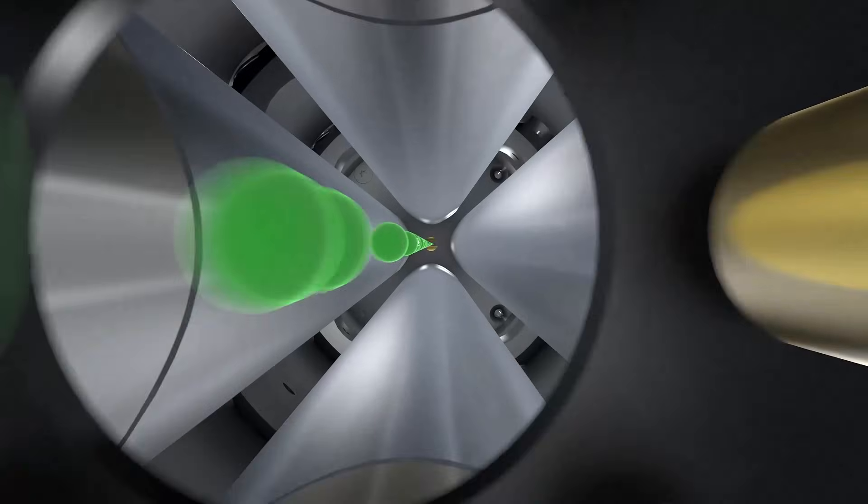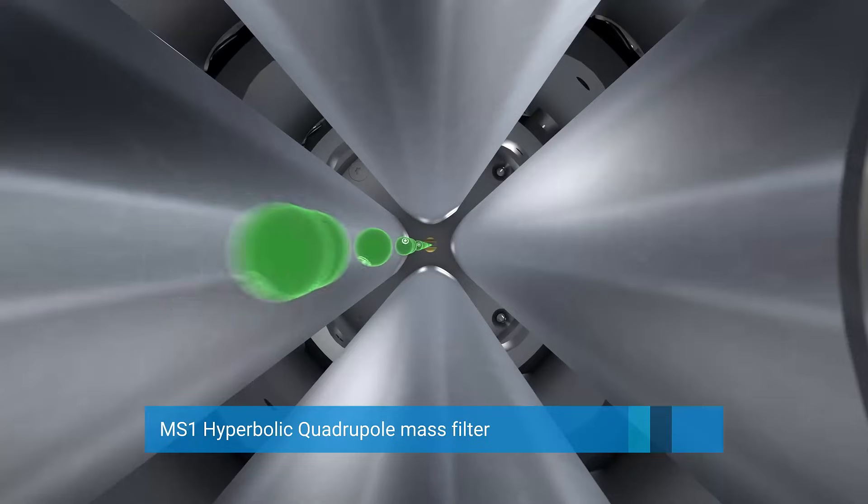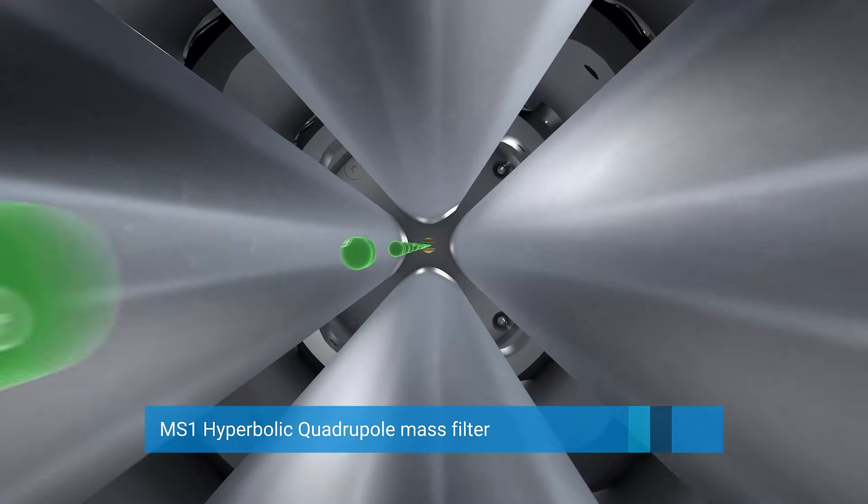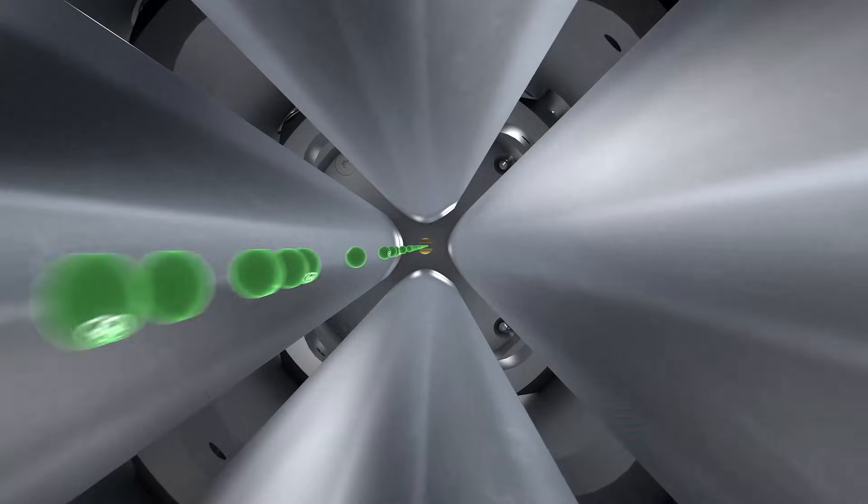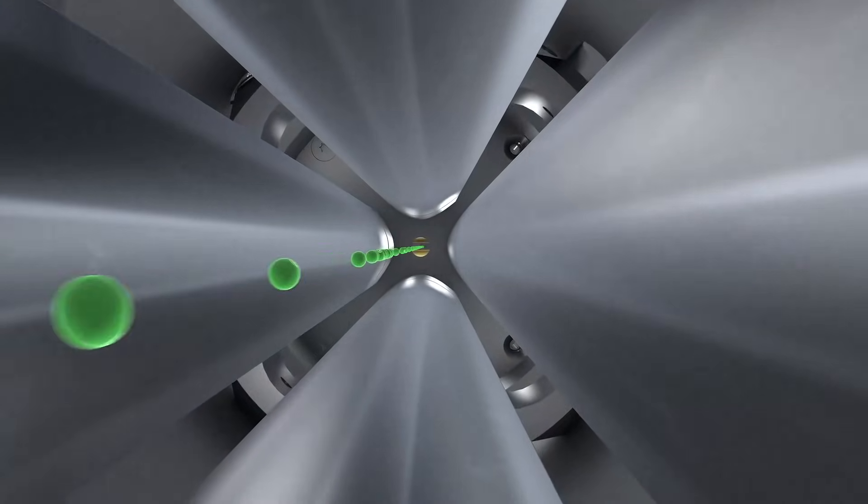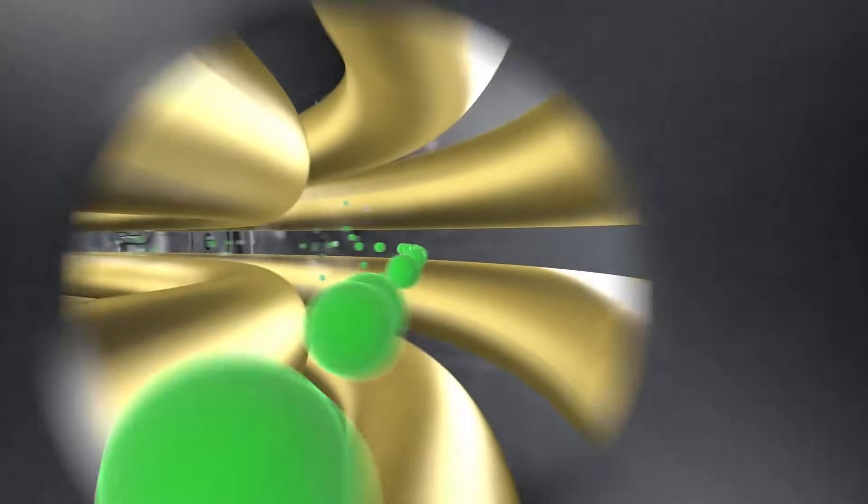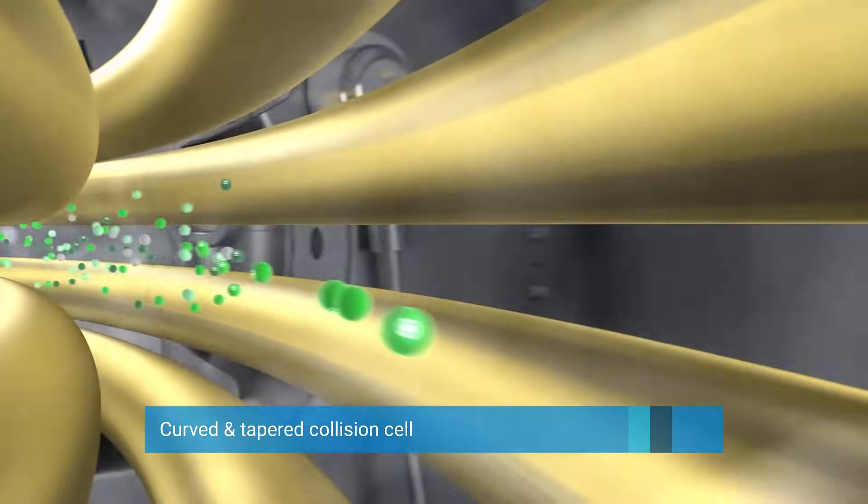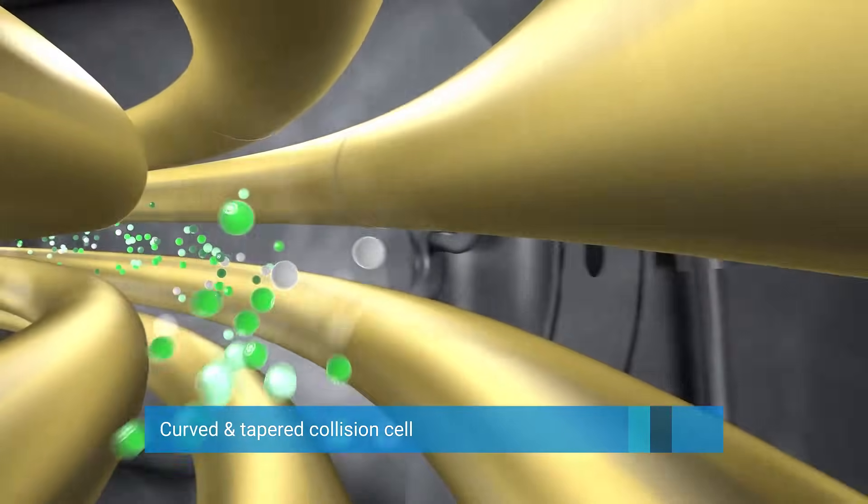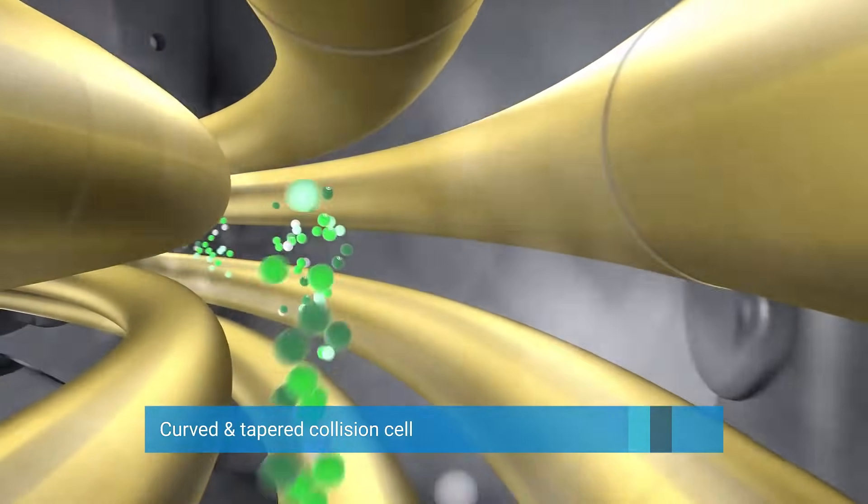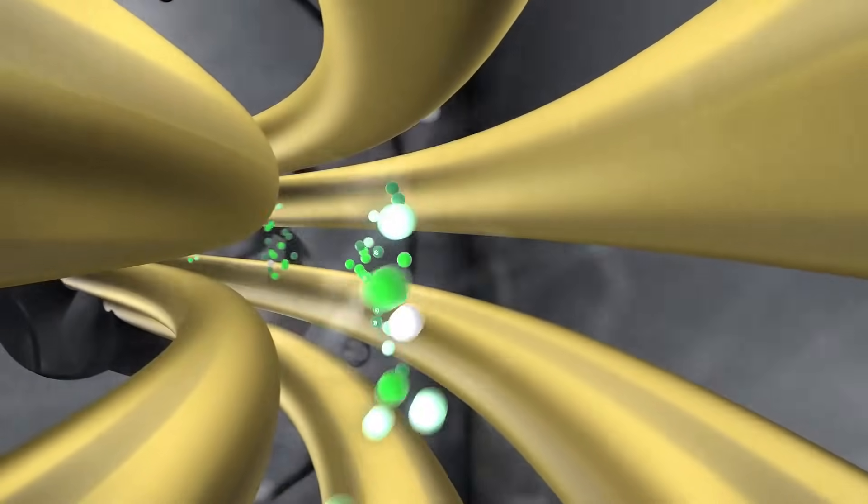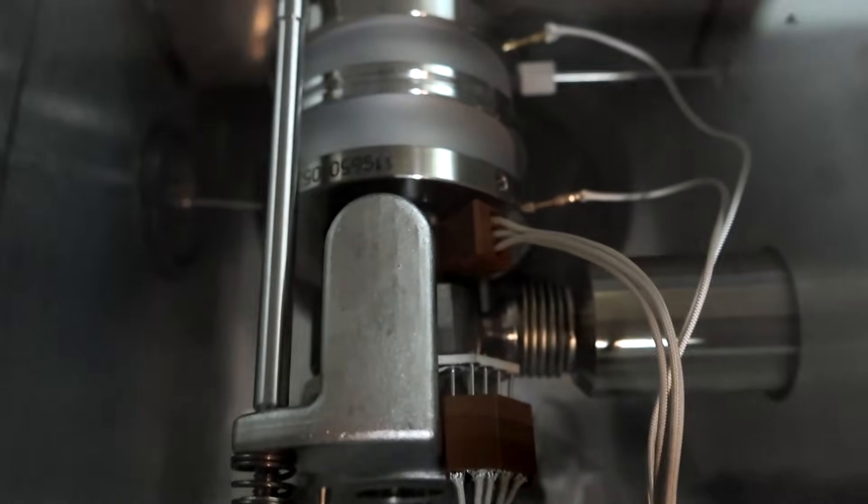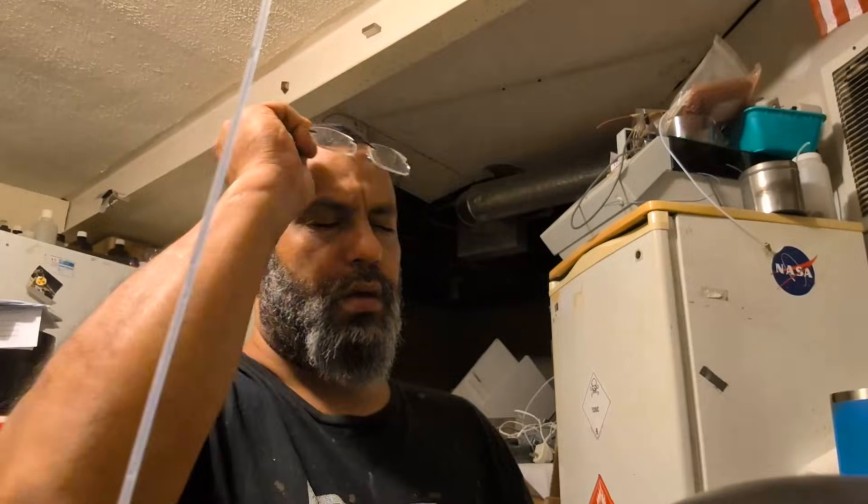The first quadrupole is a rough mass filter, but the resolution can be refined further for sharper peaks. This is a necessary step for the following fragmentation in the ion trap and collision cells. Basically, the cell breaks down the molecule further so we can determine the fragment origin and reconstruct its nature. This is done by passing the stream of ions through a monoatomic inert gas like helium. The high speed of the molecule hitting helium atoms breaks it up in predictable ways so the fragments can be identified. The ion trap concentrates them for a predetermined amount of time before sending everything it collects to the detector.